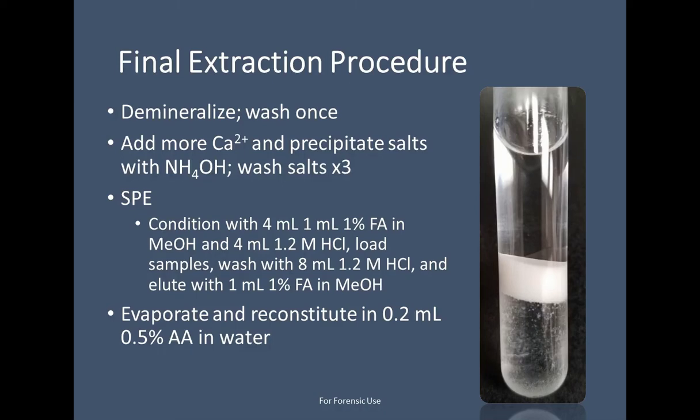started with. So a very polar mobile phase, and ideally you like to start your separation with the same mobile phase your analyte is dissolved in. And in this case, that worked pretty well. And so in this picture, you can see the separation that we get with this type of analysis. And the big precipitate in the middle would be all that calcium and all that part of the bone that we don't want, all that precipitate that falls out.